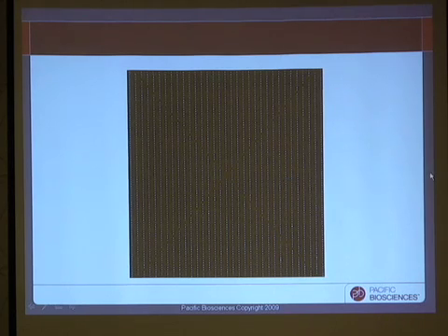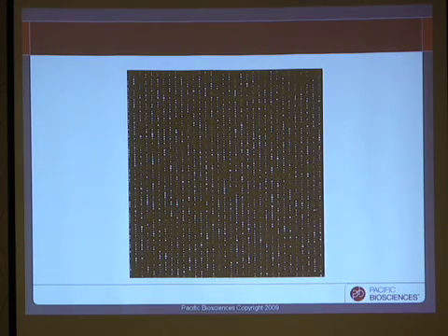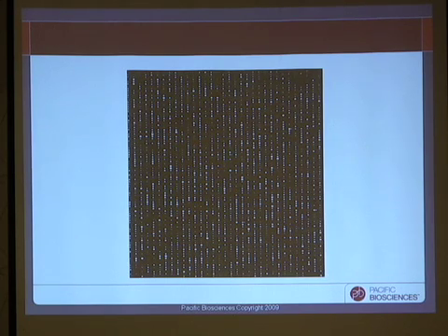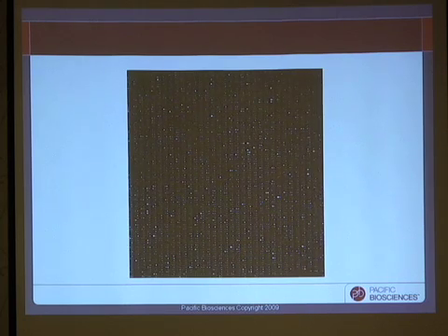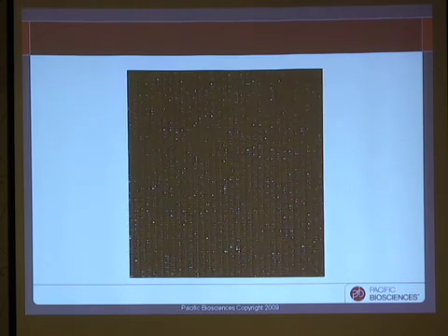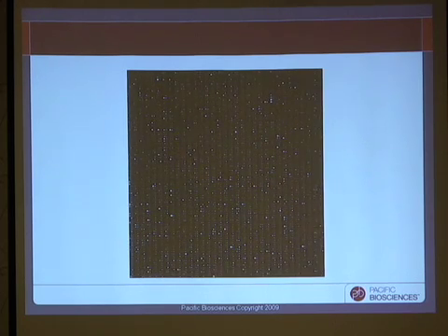So here we are looking at just the transillumination, showing the positions. This is cognate sampling, so all of these are the same color. And then in just a moment... My movie stopped. There. Actually, I'm going to show that again. You missed a good bit. So now we're looking at sequencing for 3,000 holes simultaneously operating, in this case, between 3 and 5 bases per second. Let me just show you that movie again.